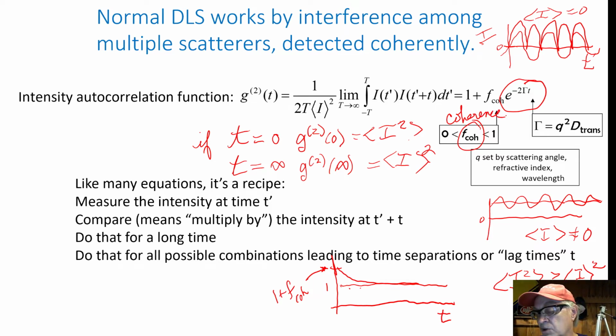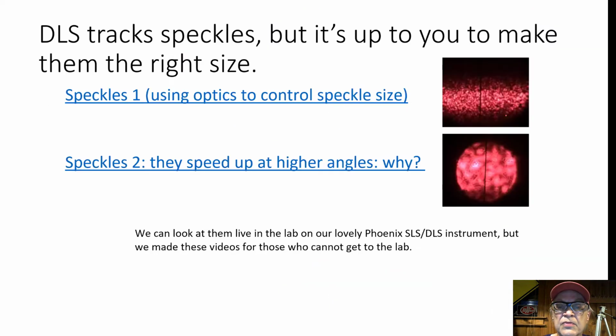And it's mostly a measure of how well your optics got you looking at just a few of the fluctuations, how well you could observe the fluctuations. There can be some other electronic things that go on and affect that parameter here, but it's called the coherence parameter for a reason. It's a measurement of how coherent you've made your optical field, because that's what it really takes to see those fluctuations.